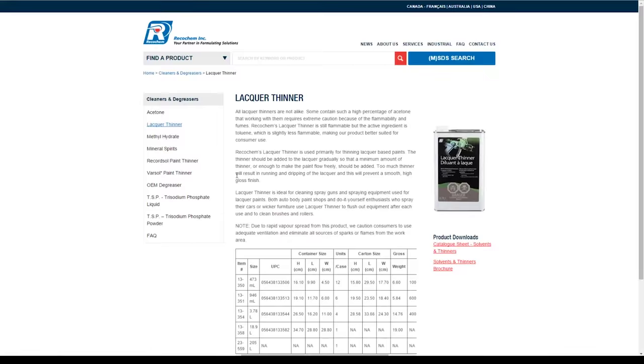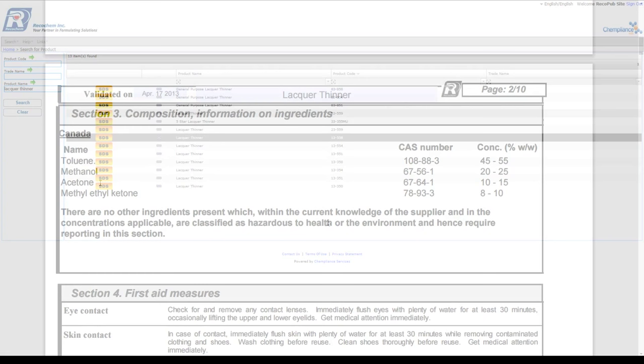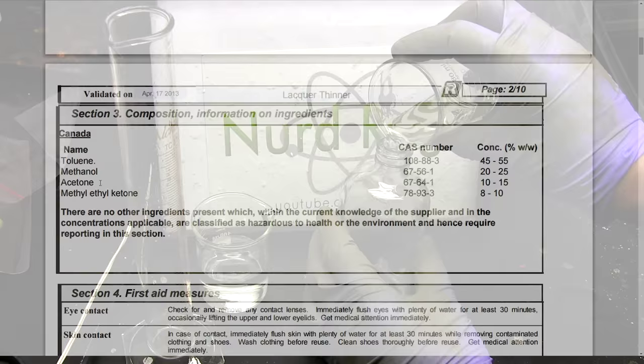Alternatively maybe the manufacturer has different formulations for different countries based on the local cost of materials and I got a different formula for different MSDS. Nonetheless the toluene is pretty good, almost half, but for greater confidence we can do some crude testing.